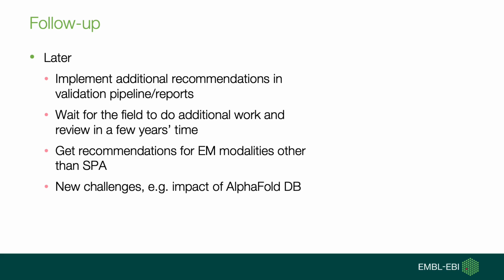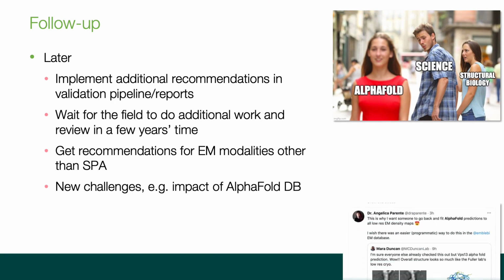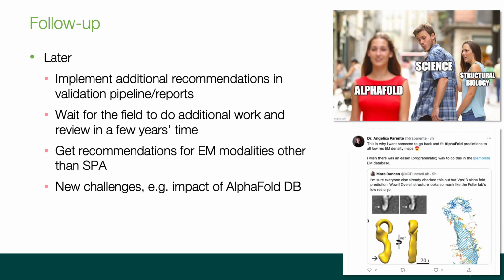For example, recently we released AlphaFold DB, and that of course immediately gave people the idea that, wait a minute, there are all these old low resolution maps lying around, and now we can go to AlphaFold DB and see models that look as if they fit those old maps. So why don't we go and put those models in those maps and refine them? And of course, validation at that kind of resolution is a whole new challenge.